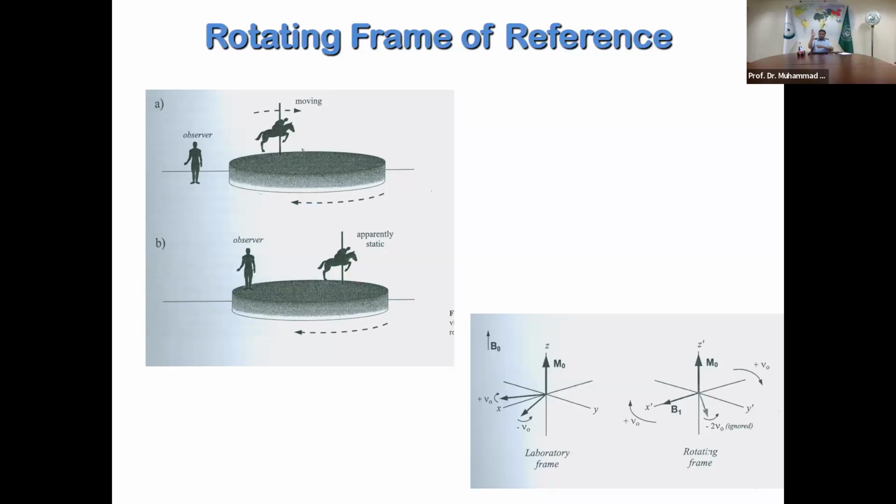And for that, you need to understand not only, when you give a radio frequency pulse, where the vectors will go, but also that after some time they will split, and that their position on the XY plane will only be understood with the concept of the rotating frame of reference.